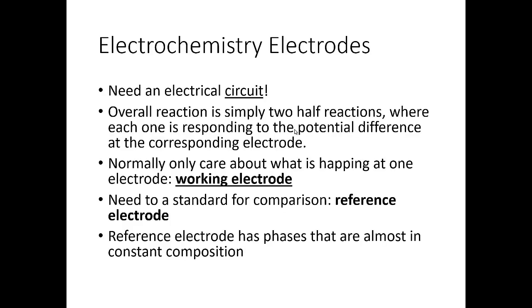because everything we've done so far has just been the precursors, but let's look at the real world. How is electrochemistry typically used in the real world? To begin with, in the last couple slides, I used some names you are probably a little familiar with, a reference electrode, but then also a word called working electrode. Working electrode is the place through which we are taking the chemistry measurements.